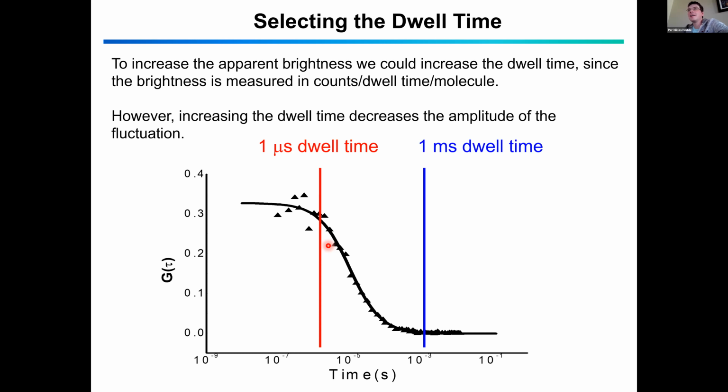And the reason is that we move from one pixel to the next with our laser beam with dwell times on the microsecond time scale, which we just discussed for the RICS. And in a cell, typically molecules don't move that fast. So the condition is well fulfilled.